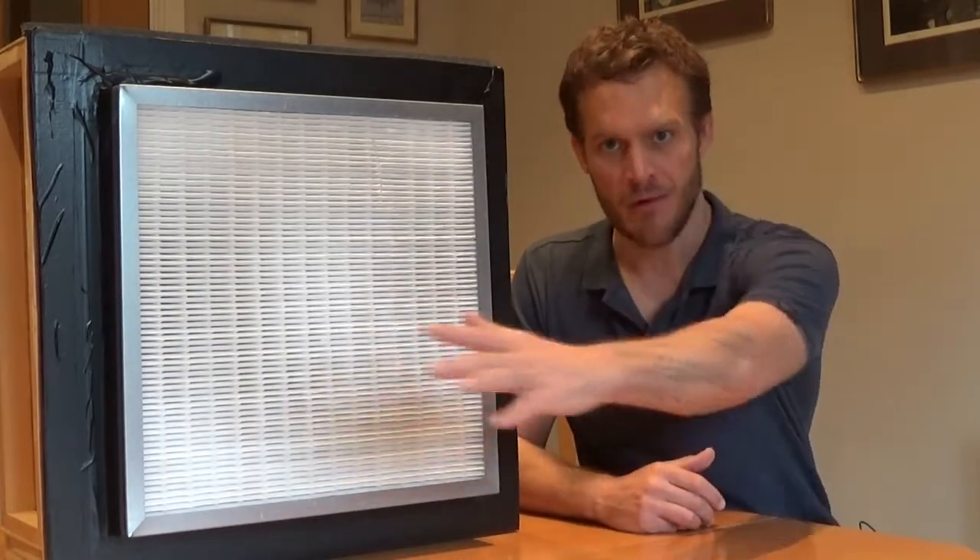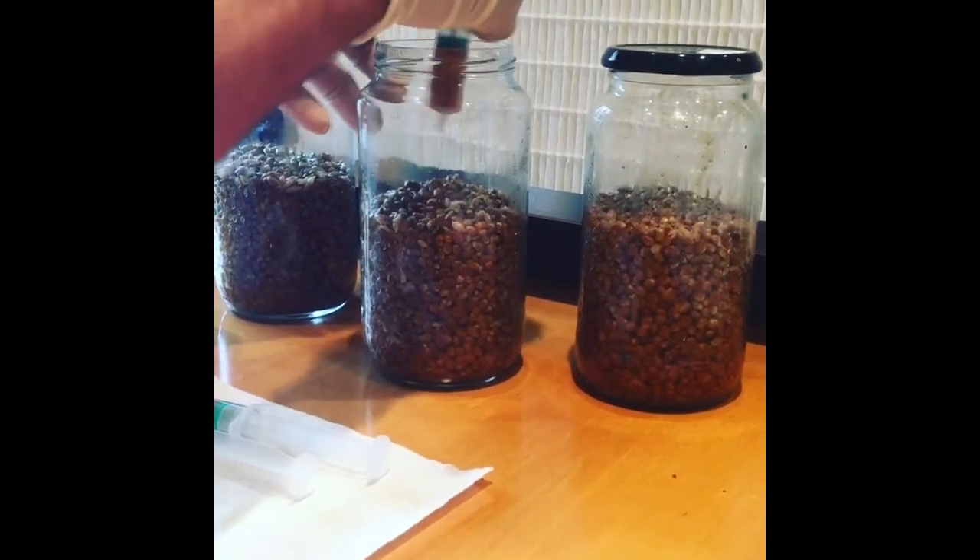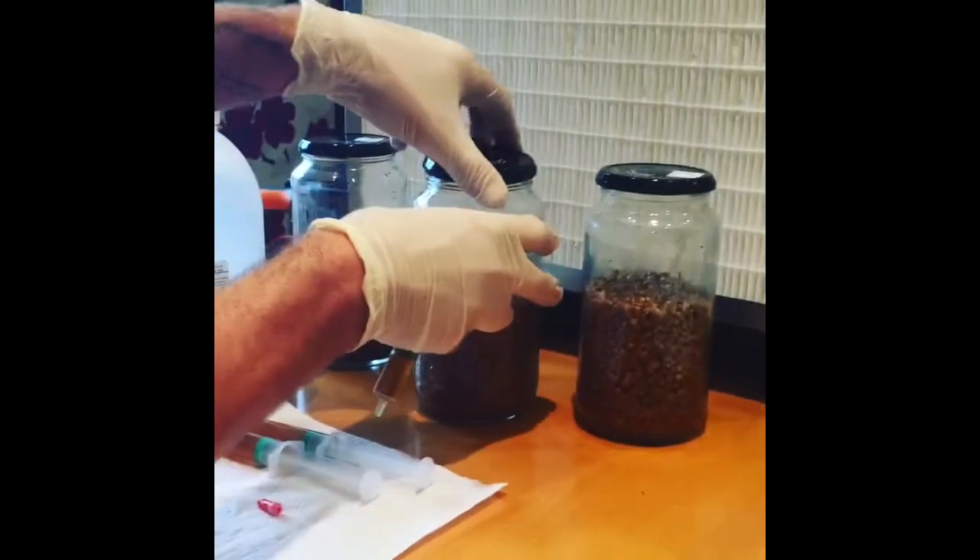So it only lets through particles which are sized 0.01 or something like that, so no bacteria can get through, no viruses can get through. The air has been pushed through, so you've got sterile air in front of it. And that's where obviously you do all your culture work, anything that you want to do where you want it to be nice and clean. So that's the idea behind it — really helpful, really handy. This is going to be a demonstration of how to build one for home growers or micro farms, things like that.